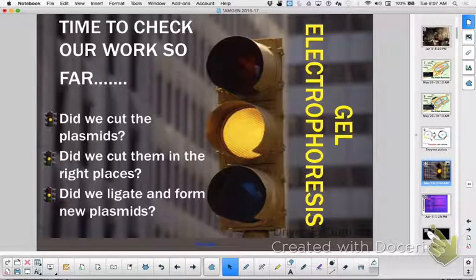In this lab, okay, there are some bells we can't unring. So think this out. You're learning the tools today so you don't screw up. Next class period, when you cut, if you mix just one solution incorrectly, we won't know that till gel electrophoresis day, 2 days later.